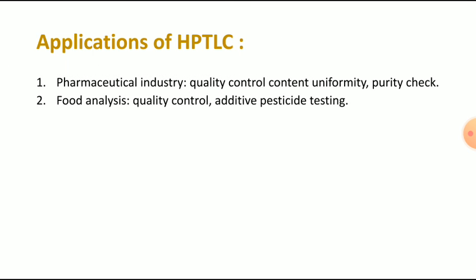Second, in food analysis, that means we can check the quality of the food with the help of this HPTLC. Additive and pesticide testing: if there is any addition of pesticide, we can easily test it with the help of this HPTLC technique.